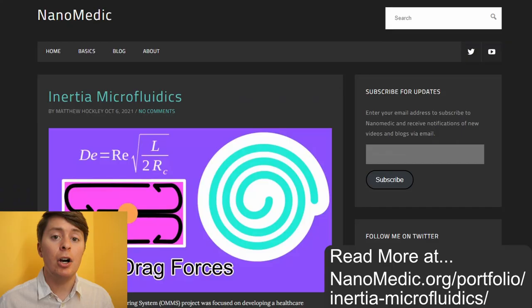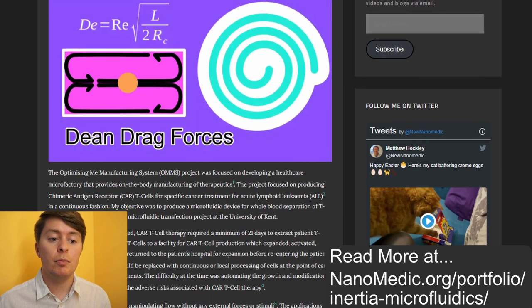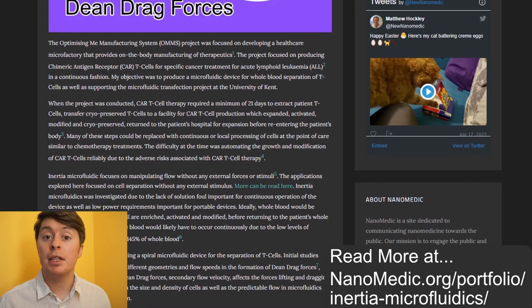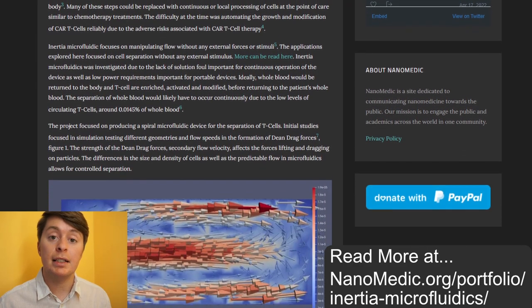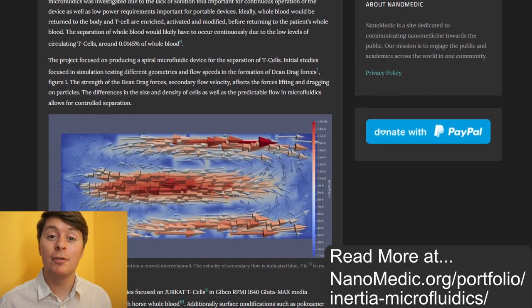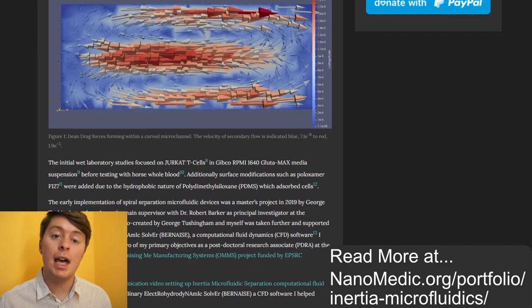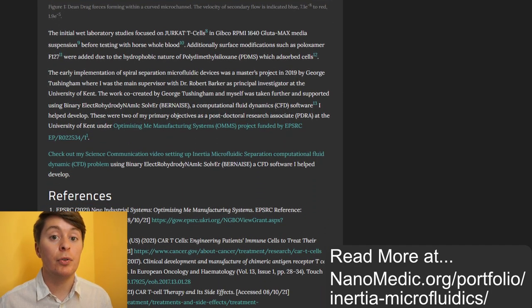And this is part of that Ohms project I may have spoken about and you may have heard about. But essentially, we were trying to separate T cells from whole blood. So we start at the beginning with just looking at T cells, which in this case were Jurkat T cells. They're a bit easier to play with because they're an immortalized cancer cell line, and we use them to test our initial separation using our microfluidic devices.